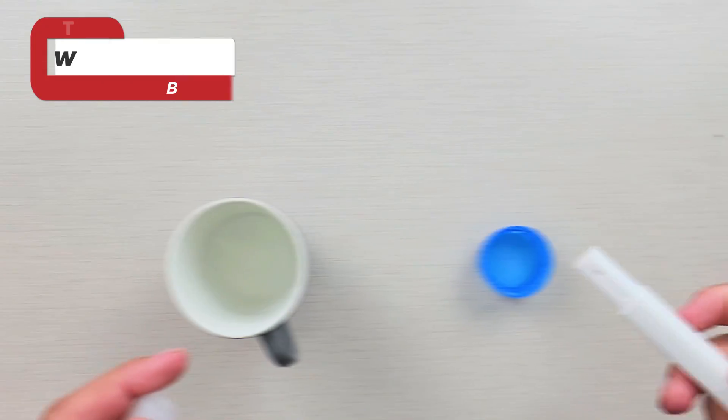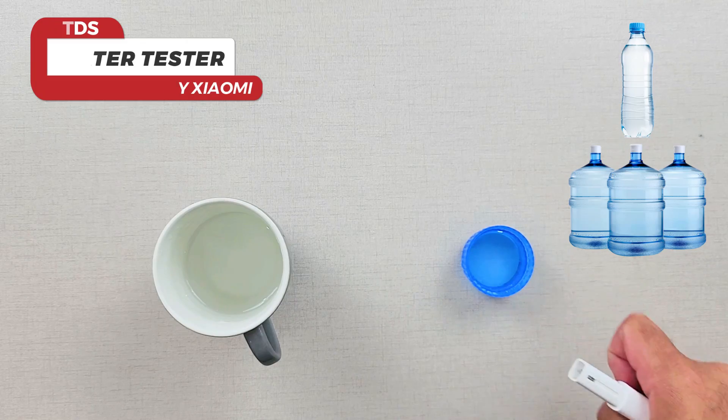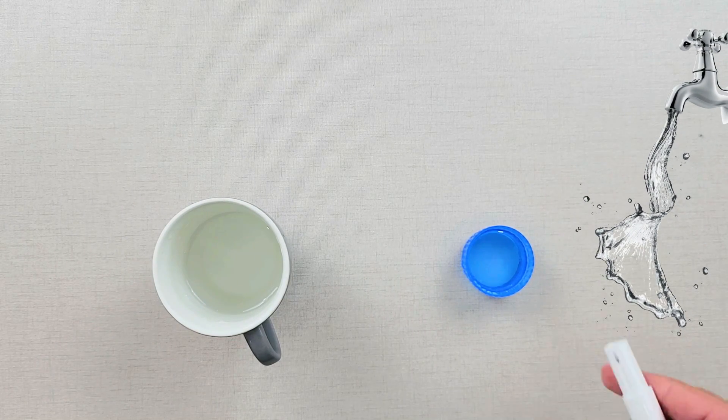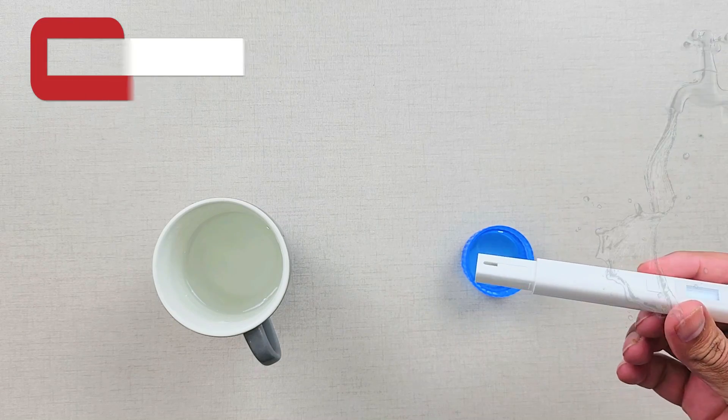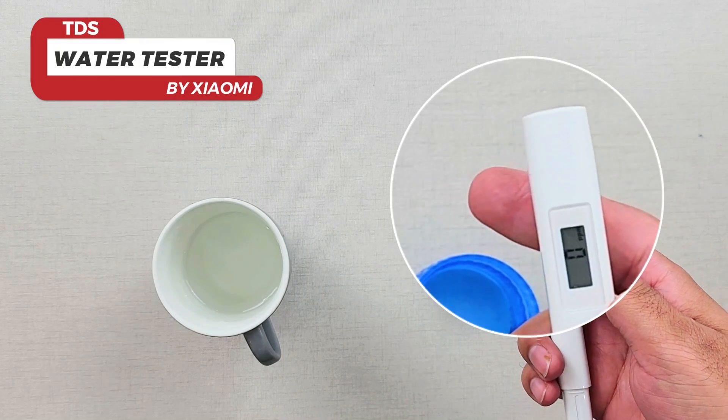Let me show you by putting it in two types of water — one purified and one tap water — and we'll see the difference between the two. On the right we have purified water, on the left we have tap water. Let's test the TDS value of each one.